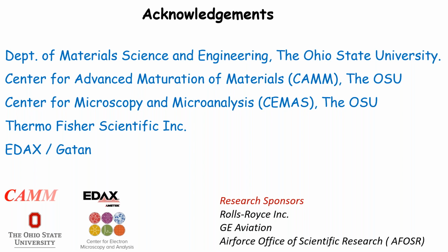And of course, in the high resolution atomic resolution image, the samples are pretty much cleaned after the nanomilling, what we call nanomilling. It removes some of the amorphous layers caused by either gallium or amorphization of some of those elements. So there is definitely an effect of the ion damage from the sample prep, which is minimized by low kV milling of the samples before the characterization is done.